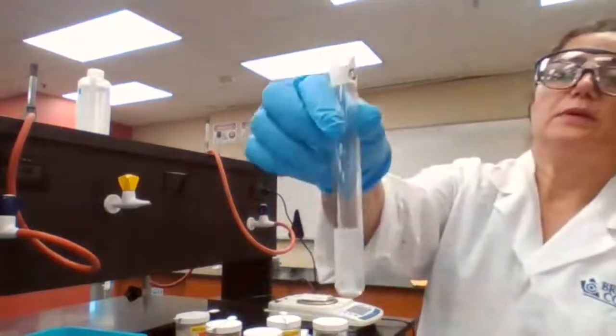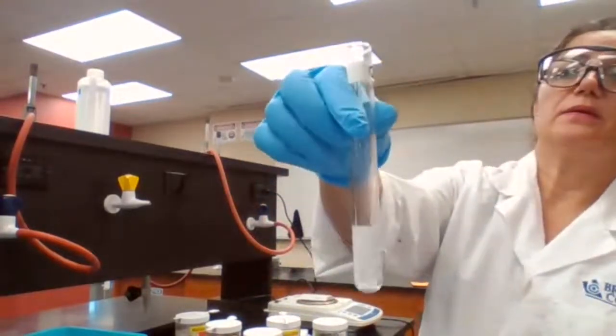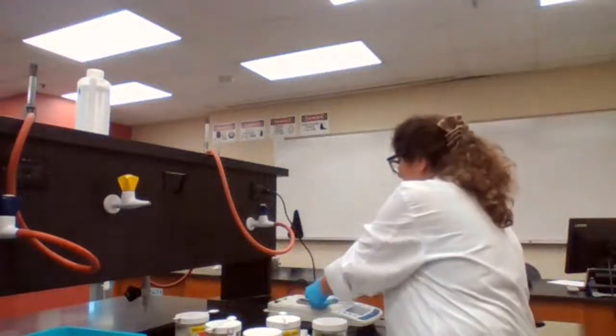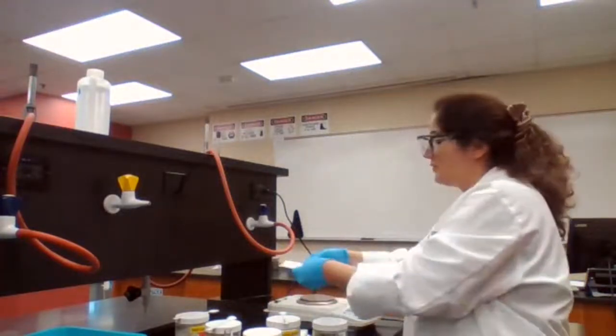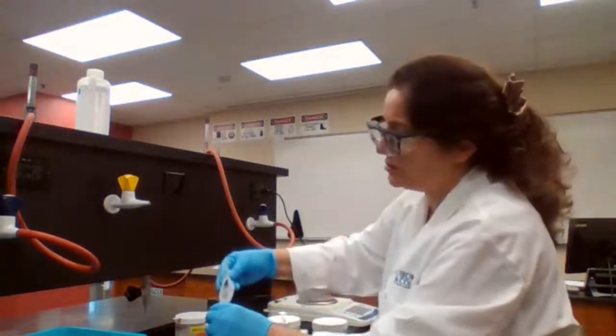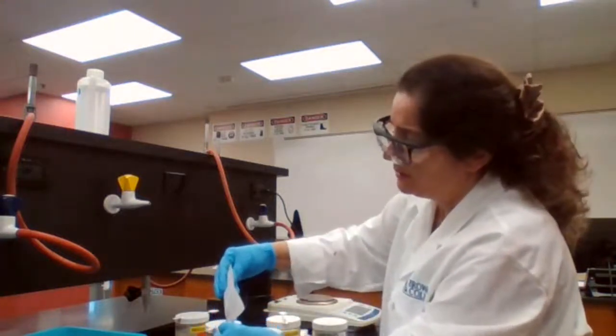D. The bubbles are forming. Okay. And I'm supposed to add the other one also at the same time. So I could hold both of them for you, even though it's not the safest, but because of the hydrogen gas that is being released.